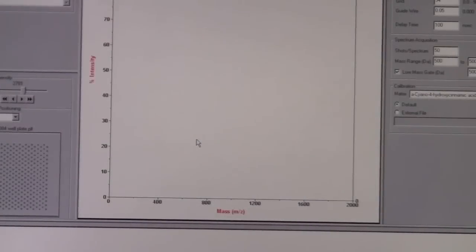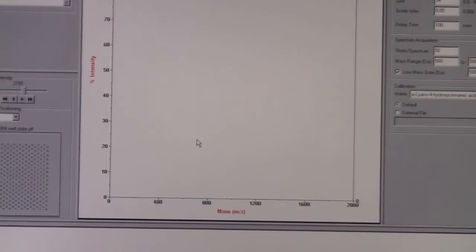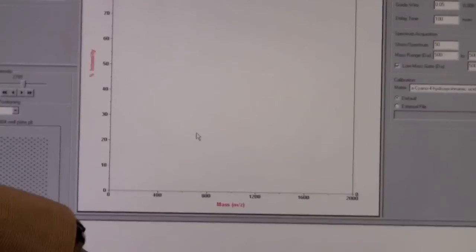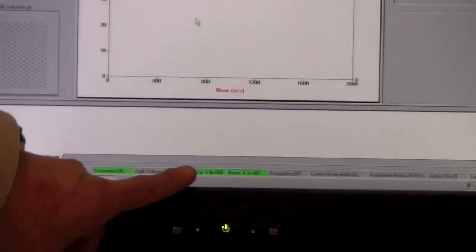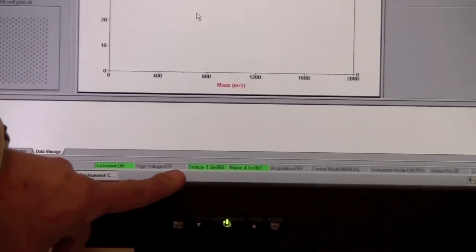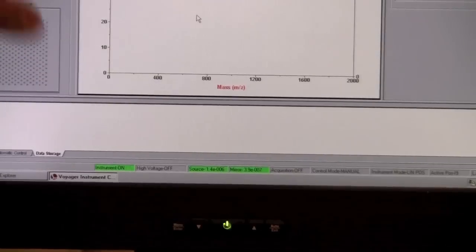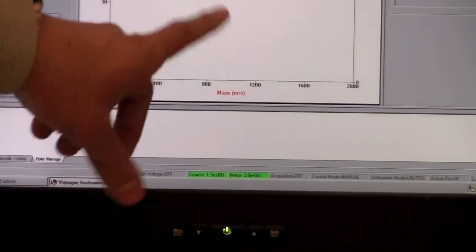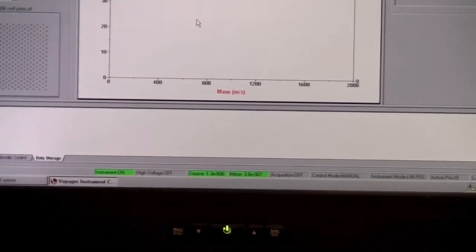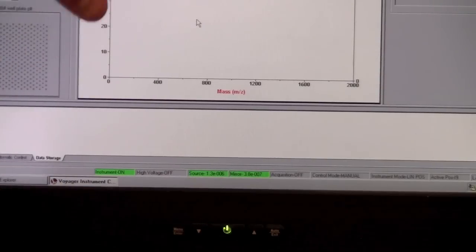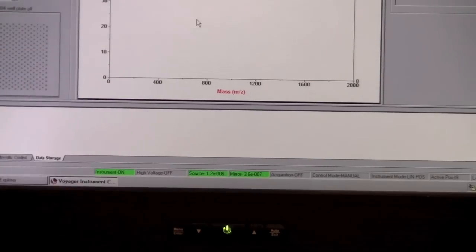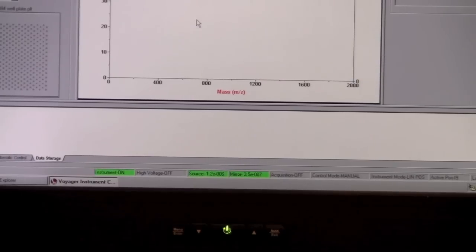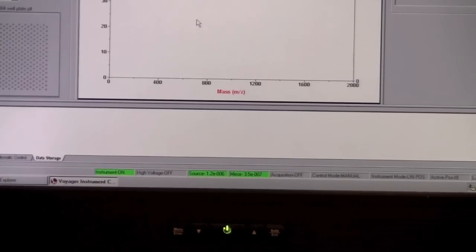The plate has loaded into the system. One thing I'd like to point out this time is the source and mirror pressure here. They're in the green. When it loads the plate into the system, it's going to bring up a window that says checking source pressure. It's trying to pump down the system after it's loaded the plate in.